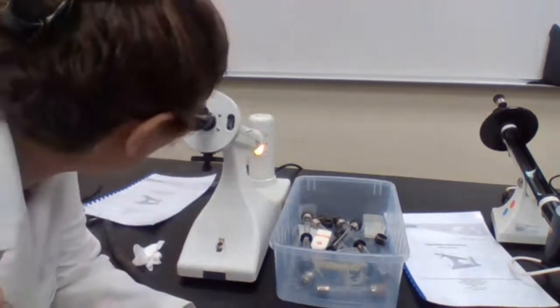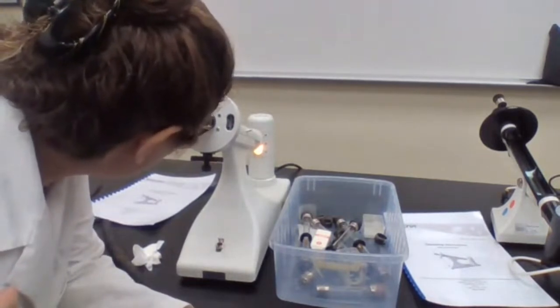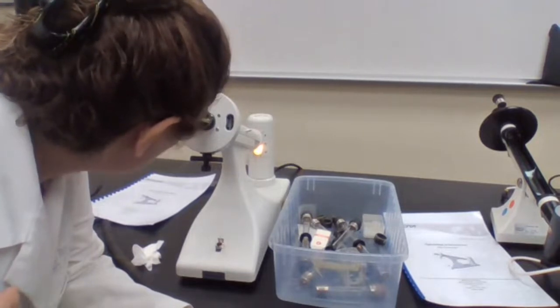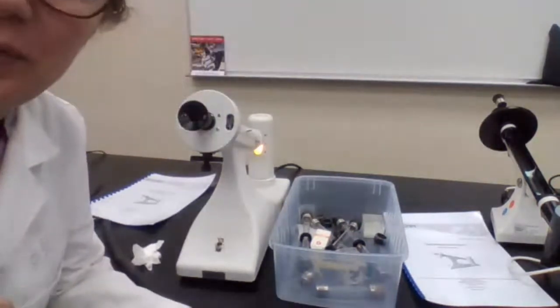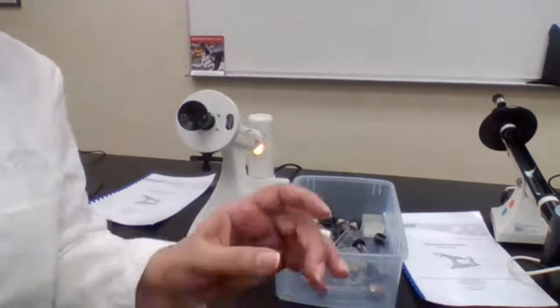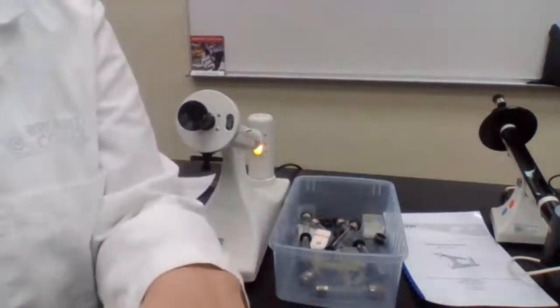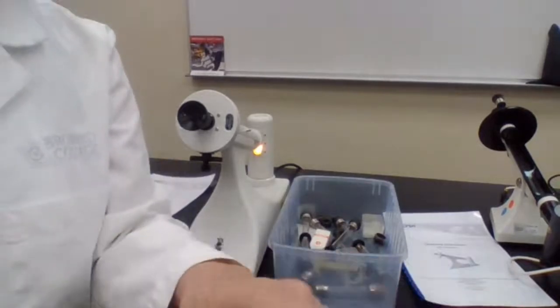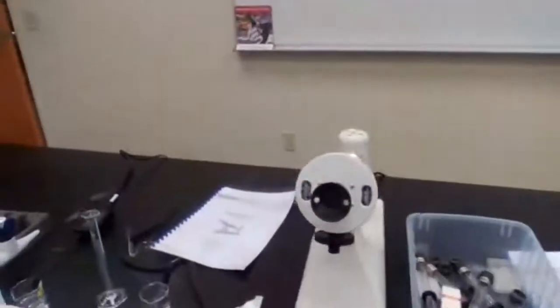the cutoff. The number for me is 15.9. Record that number, please. 15.9. And this is known as the observed rotation.